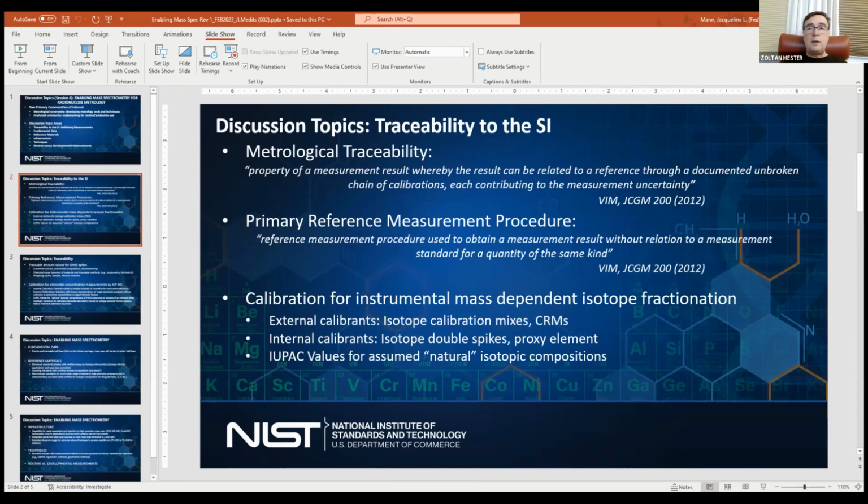So carry the uncertainty concept all along, and it would be important to understand where the radiometric measurements are in uncertainty need versus, let's say, the stable isotope ratio measurements with mass spec, and also the mass fraction measurements with mass spec.